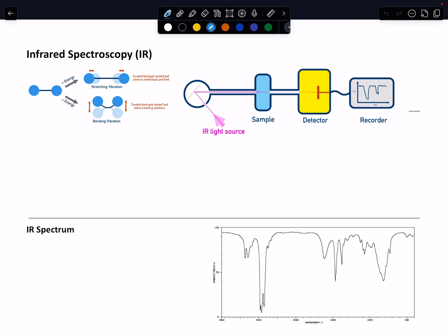All right, so infrared spectroscopy utilizes radiation in the infrared range of the EM spectrum. That energy is relatively low in terms of some of the other techniques that we can look at. So what that energy can do is, if you have a molecule, as shown here, and you irradiate it, two things can happen.